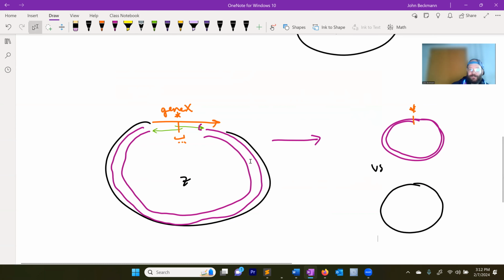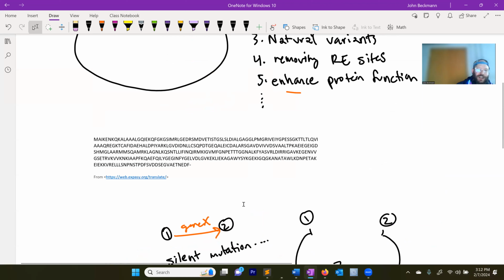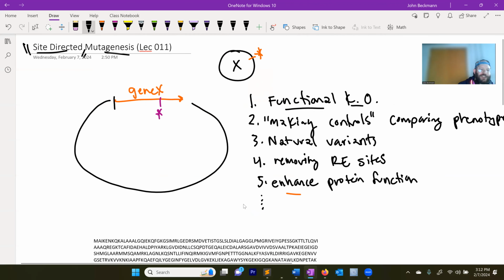Any questions about that? Yeah. So I'll show you what the primers look like. We'll design some. You bring up an interesting point, it depends on the size of your primers and the size of the difference. So when you do site-directed mutagenesis, typically you're only changing like 1 to 2, at max, 3 codons. I've done a reaction where you change 3 codons, but that's kind of like it. So you bring up a point that if you're going to change a whole bunch of sequence, your primers won't even bind. And so the reaction will get less and less efficient the more you're changing.